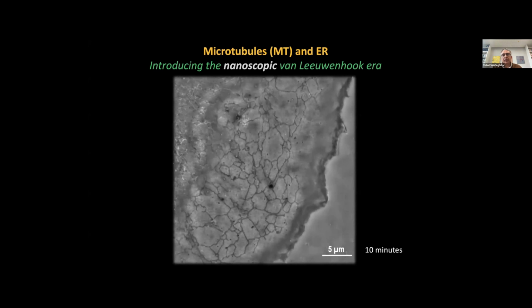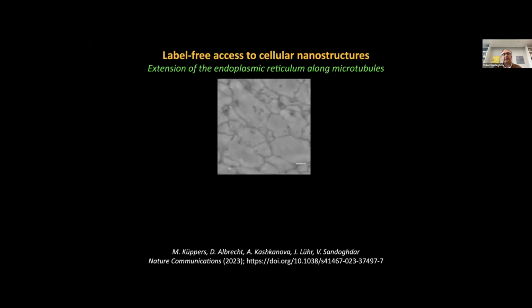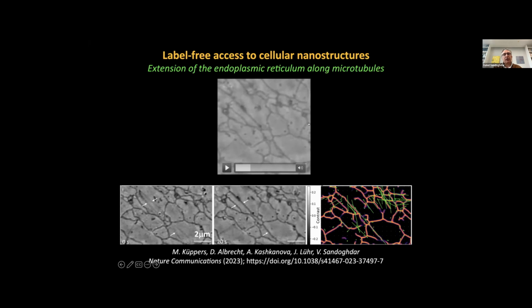And these include lots of small vesicles and things that we have then tried to identify. And I will show you a little bit of that in the next slides. So I showed you this video already, and there was the running of an ER on microtubule and the fact that we could analyze the motion of the ER I talked about.